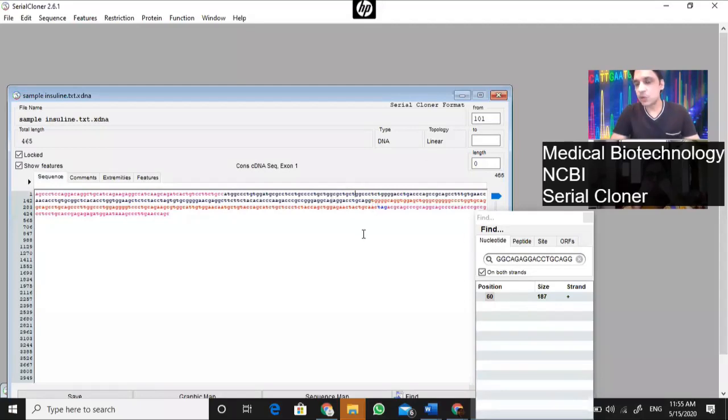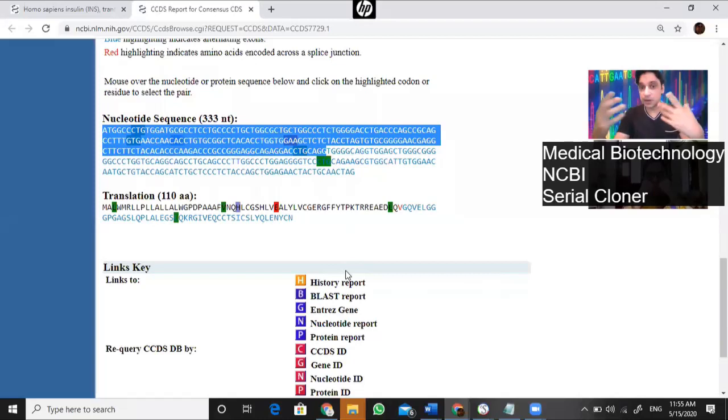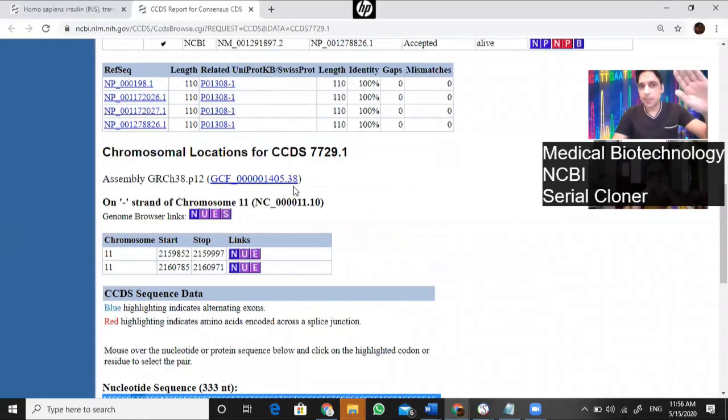And then similarly you can add more features. From wherever you get certain information, you can implant all that information in your local file, which you can use later on to write your thesis, to answer certain questions, and to have a customized file of your own choice. If somebody is working on one particular codon or a mutation present in one particular place, that person can highlight that region as well. So that is how you can use this page as well.